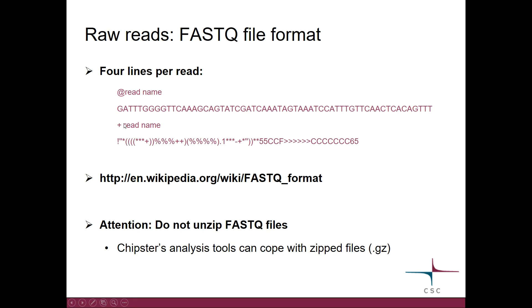These are actually the quality values of the different base calls. There is an excellent Wikipedia page where you can read more. I want to mention that when you get the FastQ files, they are typically zipped, so please do not unzip them — it's not necessary. When you are doing analysis in Chipster, the analysis tools can cope with the zipped files.